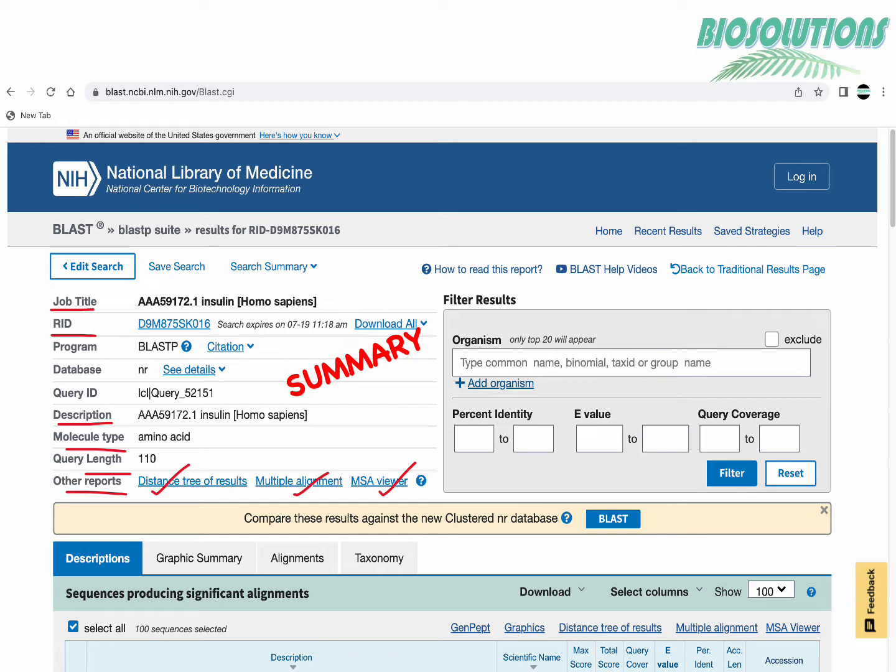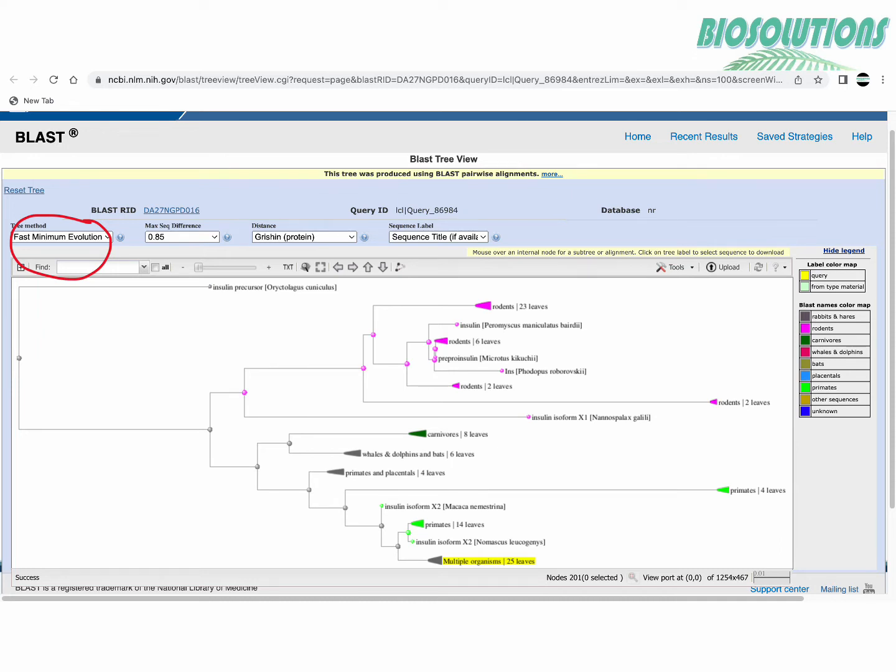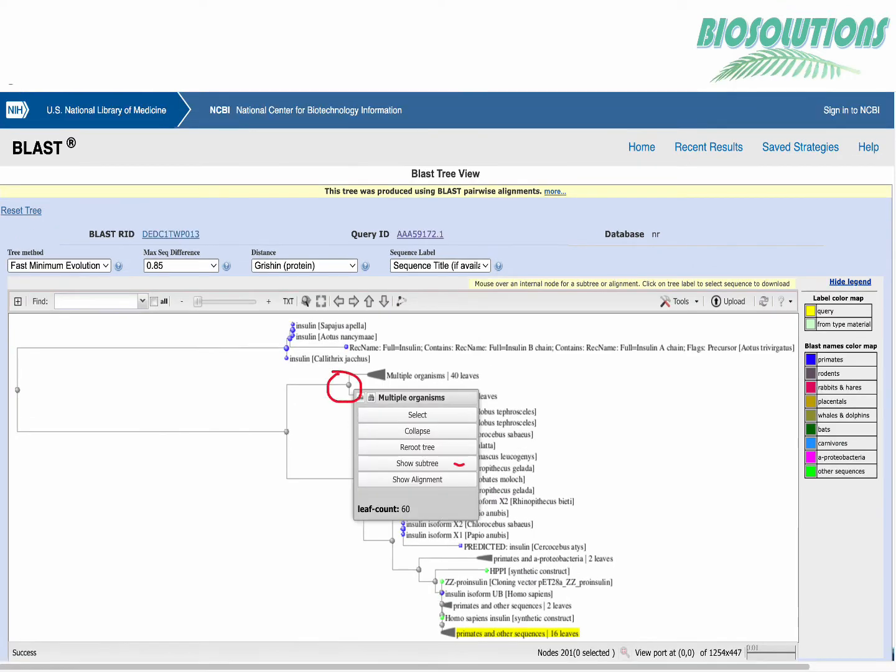Under other reports, distance tree of results presents the matches in a distance tree format. Here in this phylogenetic analysis the multiple alignment of insulin amino acid sequence from various organisms has been used to create this distance tree. The tree building method is either fast minimum evolution method or a neighbor joining method.